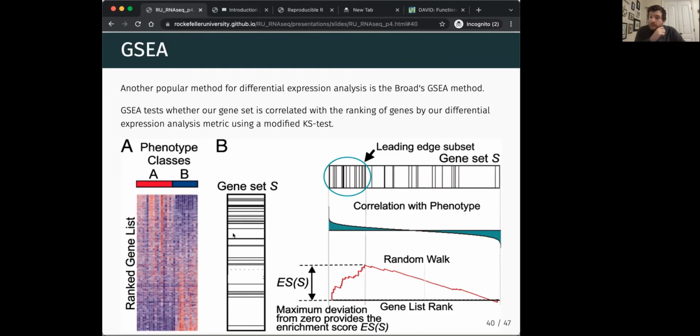But quite often we actually prefer, there are some other algorithms like I think it's called parent-child algorithm. And so that statistical test instead will downweight some of these really big terms and promote some of the smaller terms.